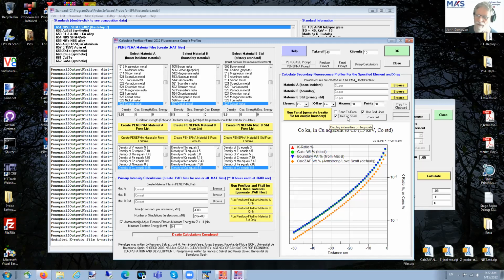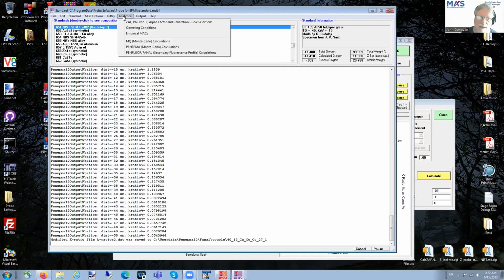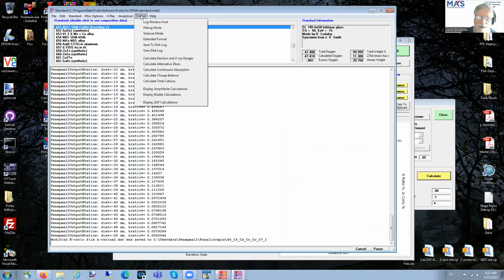approached me from Oak Ridge National Lab, and they say they were getting weird results looking at magnesium, aluminum, and zinc alloys. I modeled it for them and showed them that they would be able to detect their zinc component grain half a millimeter away from their aluminum magnesium boundary. In that case, of course, zinc K alpha being a very penetrating X-ray, and magnesium aluminum not absorbing it very well. So these are just some of the things you can do in this program. I think you'll find it useful.